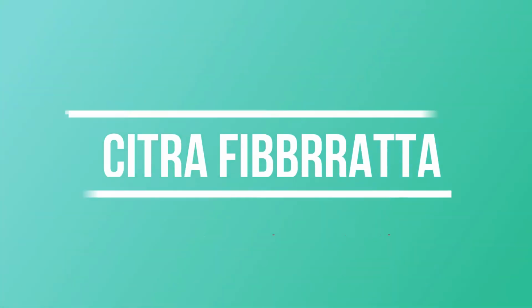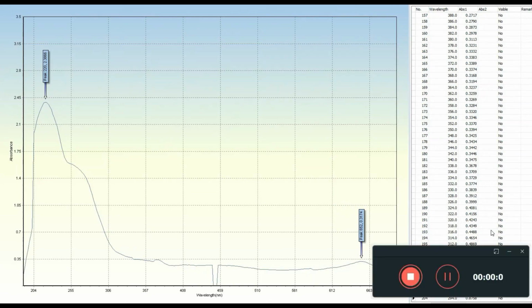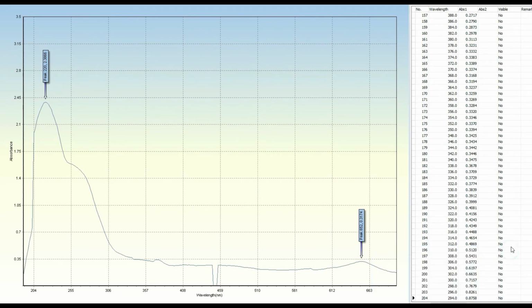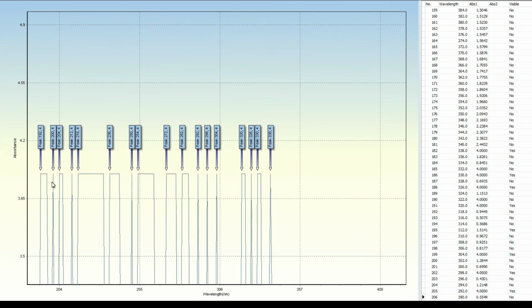So friends, the spectrum has come. This is the spectrum file of the first spectrum. This is the first spectrum of the first file, and you can see it is moniliformin. It has come at 220 nanometer. This is the moniliformin waveform. The right side is nothing, so the only concern is the left hand side. And this is the second slide consisting of the other four mycotoxins actually.